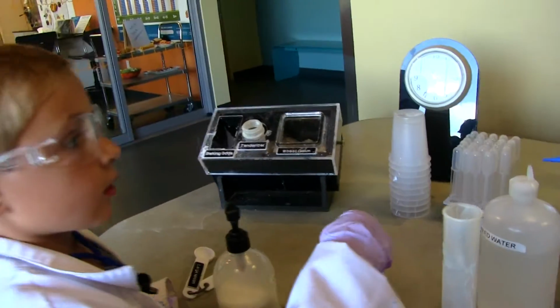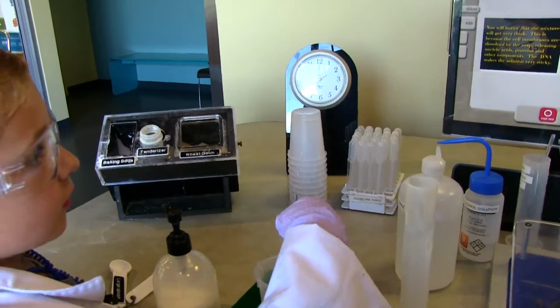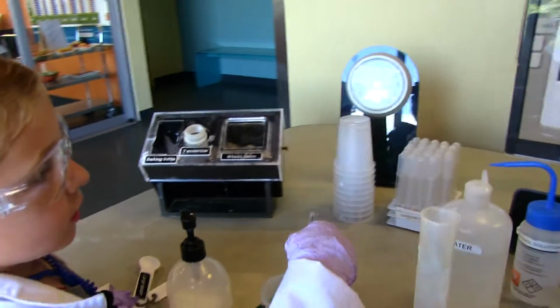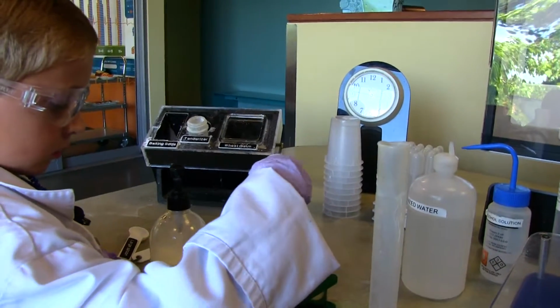This upper mixture is very thick. This is because the cell membranes are dissolved by the soap, releasing nucleic acids. Stir it and I'll tell you when to stop, okay? The DNA makes the solution very sticky.